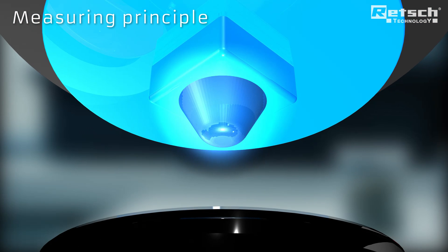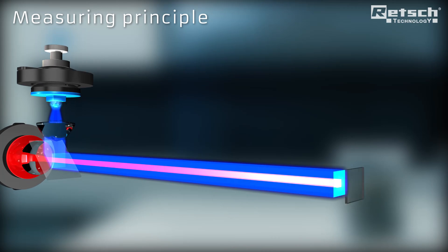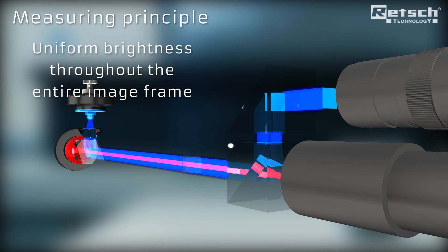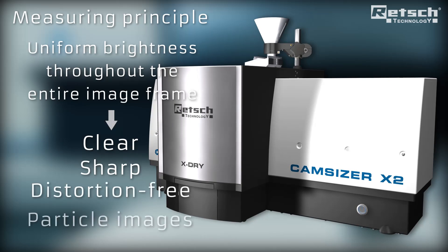The monochromatic light of two pulsed LEDs is collimated and focused to illuminate the detection area of each camera. This guarantees uniform brightness throughout the entire image frame, resulting in clear, sharp and distortion-free particle images.